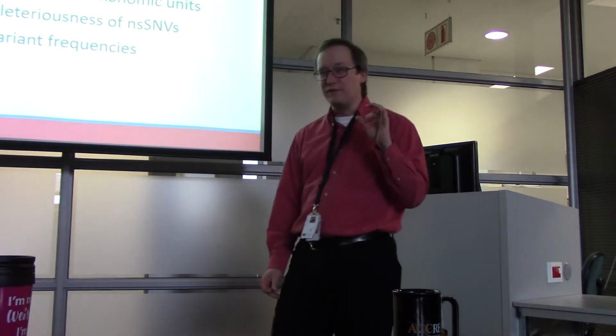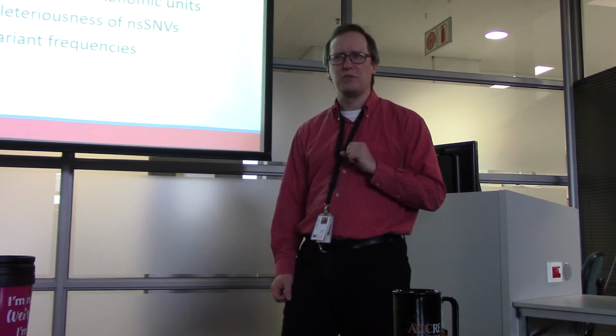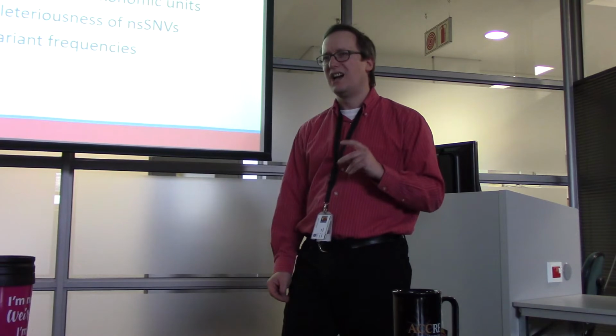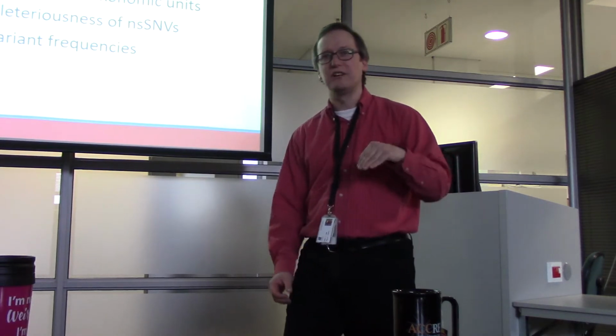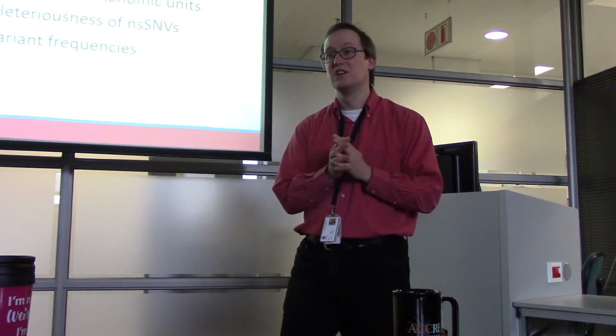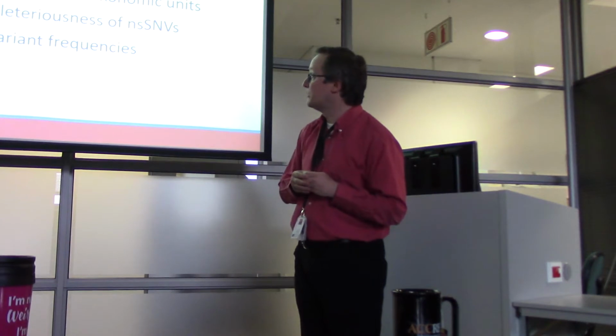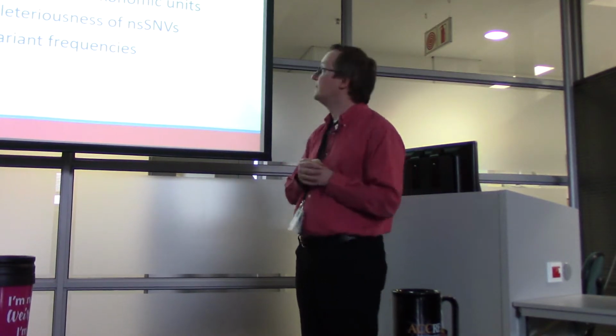We talked briefly about base calling error probabilities. You may have remembered my saying something about Phred when I was here last week. I thought it would be worthwhile to go just a little deeper into that because culling out sequences with sequencing errors is pretty important when it comes to doing Amplicon sequencing. So we'll cover that in a little more depth and the tool FastQC.